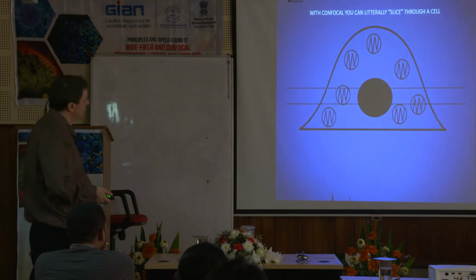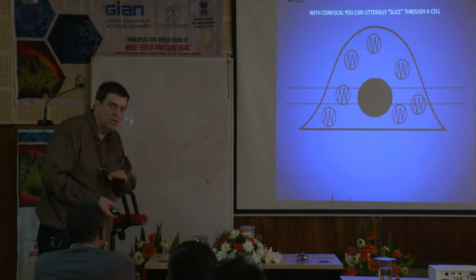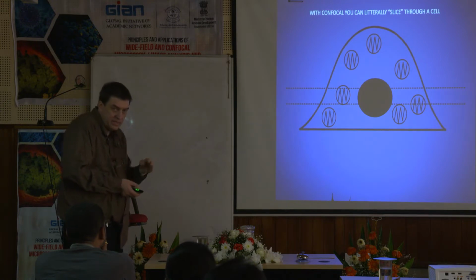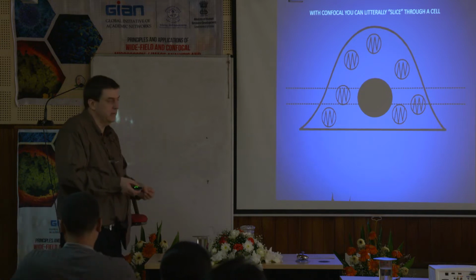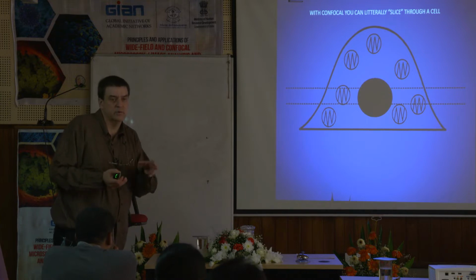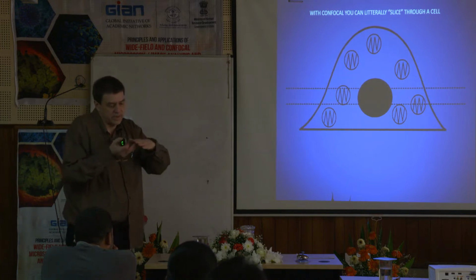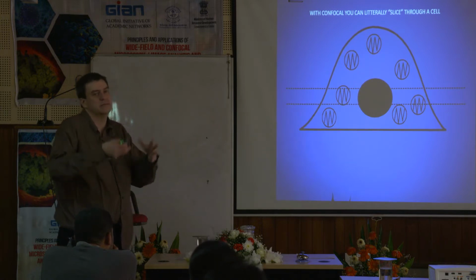Okay, so with the confocal, you can literally take a cell, something that thin, only a few microns, and cut that cell into numerous parts and rebuild that cell in 3D. So it's a very powerful tool in modern biology, and in numerous other applications. A lot of times I work with engineers looking at particles suspended in a liquid or a solution, and we'll use the confocal to determine what the structure of that is. So it's not just biology, but biology just absolutely loves this technique.